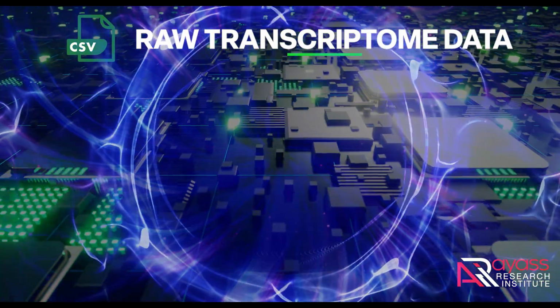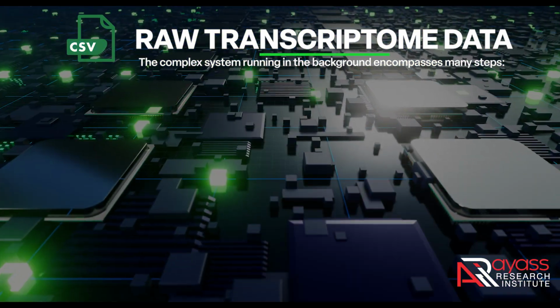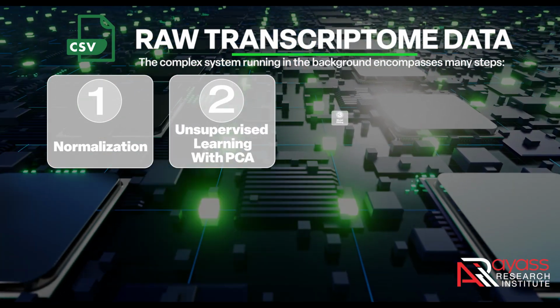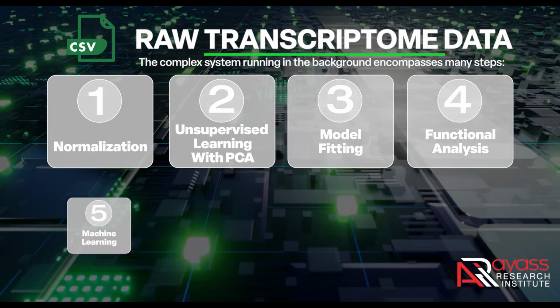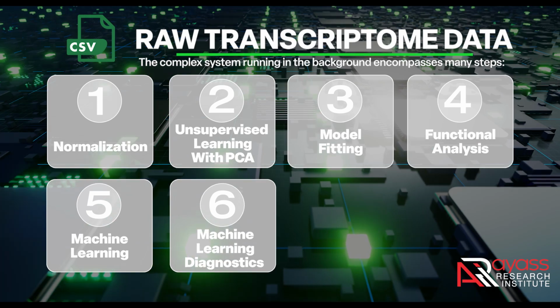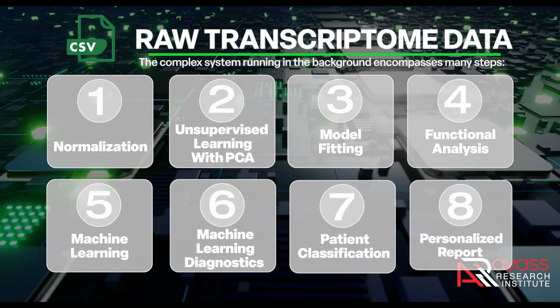However, the complex system running in the background encompasses many steps: normalization, unsupervised learning with PCA, model fitting, functional analysis, machine learning for multi-disease diagnosis, machine learning diagnostics, patient classification, and creating personalized report.